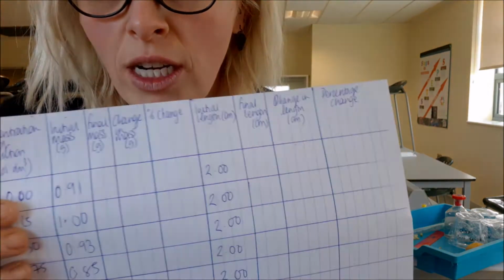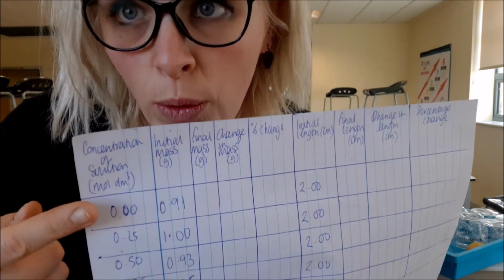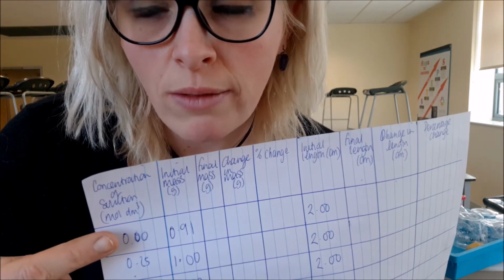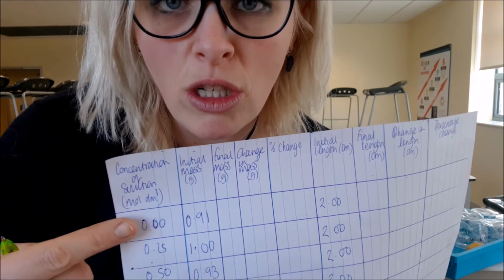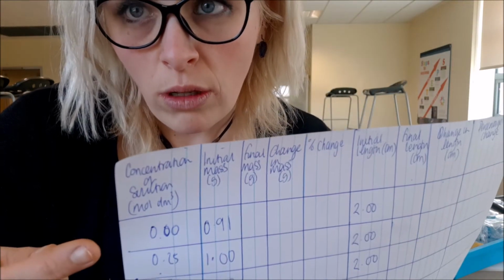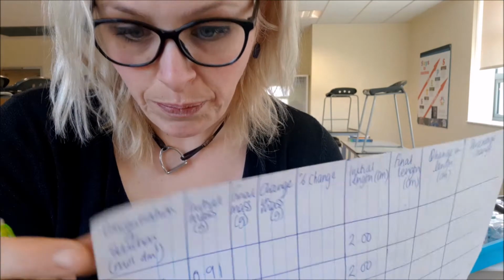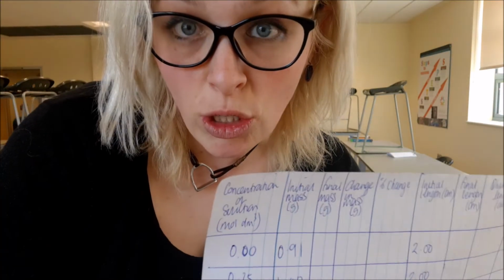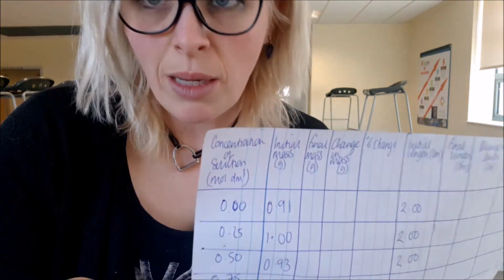So if the concentration is very low, i.e. nothing, we have a high concentration of water. I would expect that to move through the partially permeable membranes of the cells into the potatoes and then maybe increase the mass, maybe. Or we would call this hypotonic, very low concentration.